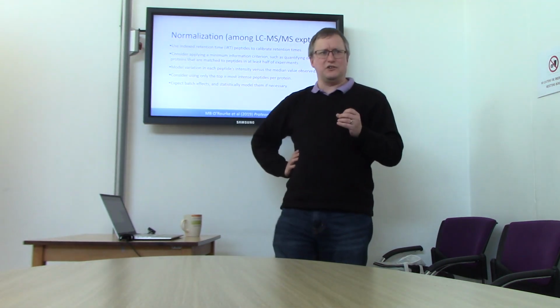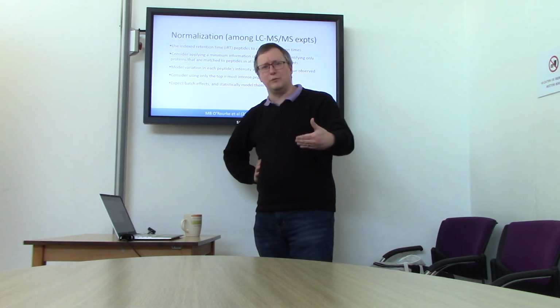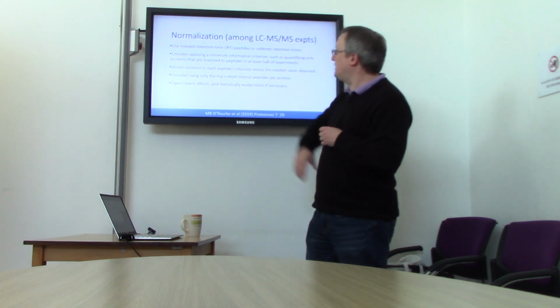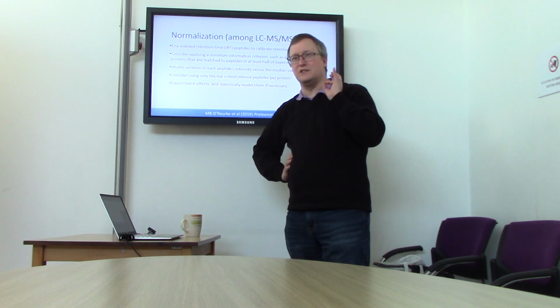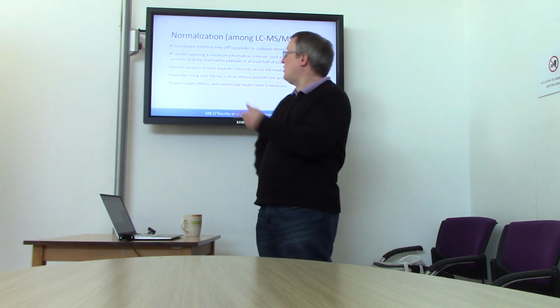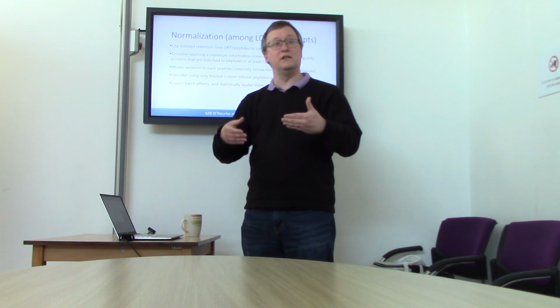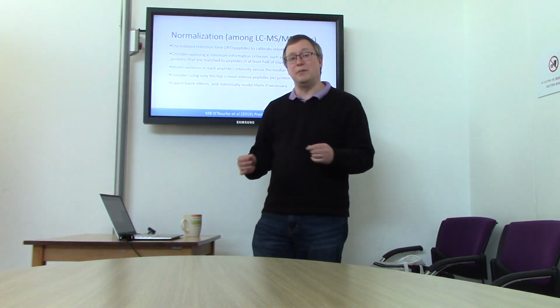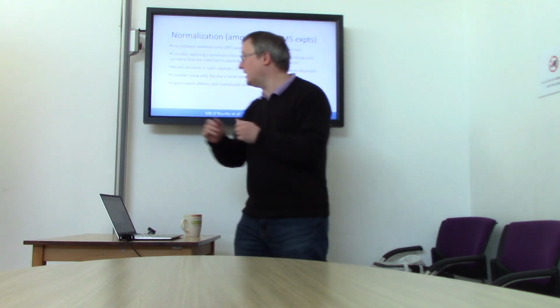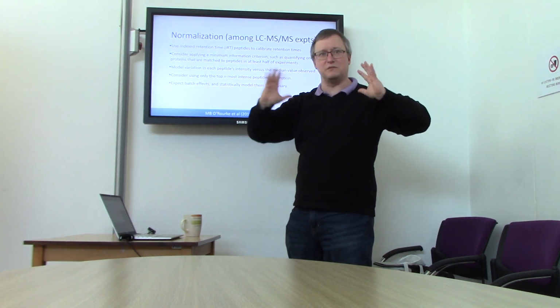Okay, now normalization. If you see me talk in the next-gen sequencing class, I talk about normalization there. I went in search of a good paper on the role of normalization in label-free quantitation, and I found a really cool paper from 2019 on this subject. We start with the idea that one of the things we may wish to normalize is the arrival of peptides from the column, from liquid chromatography. There are peptides you can purchase, called IRT peptides frequently, that you spike into your sample, and you know their expected hydrophobic performance. When should they show up? By seeing when they actually show up, you can help to calibrate the liquid chromatography separation that you're using for peptides. Very helpful. So IRT peptides can help you make your retention time adjustments much more robust.